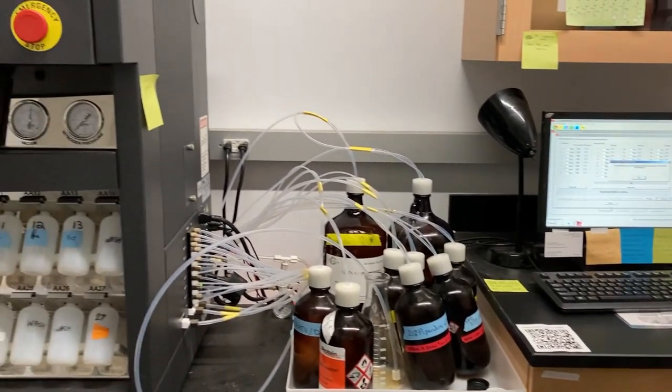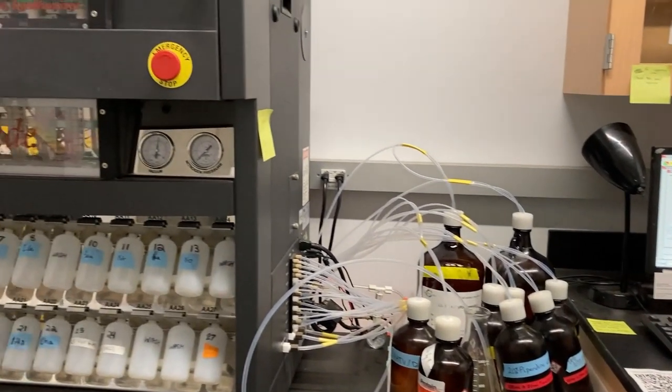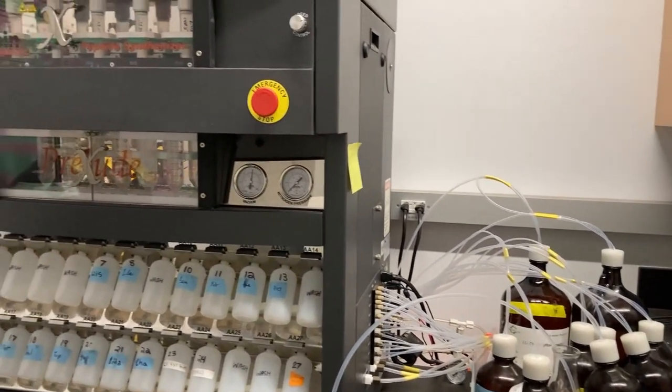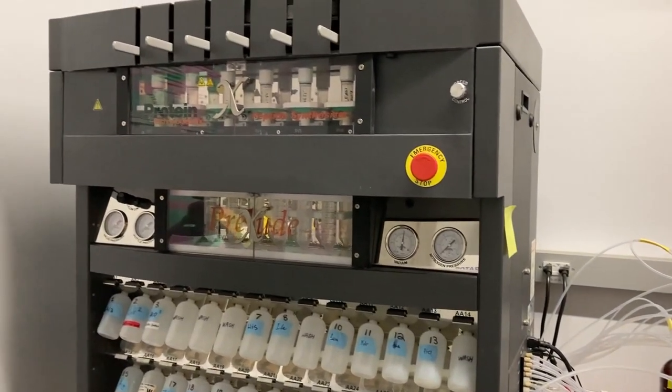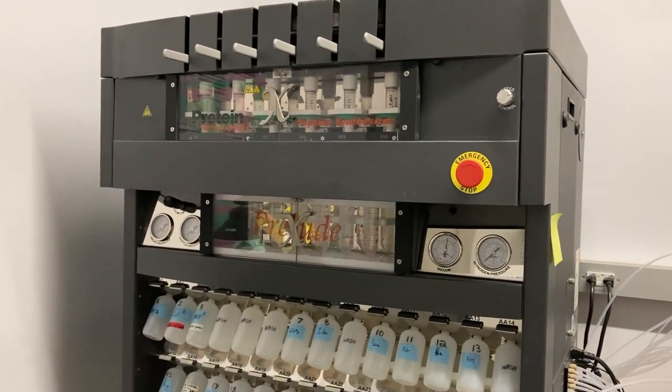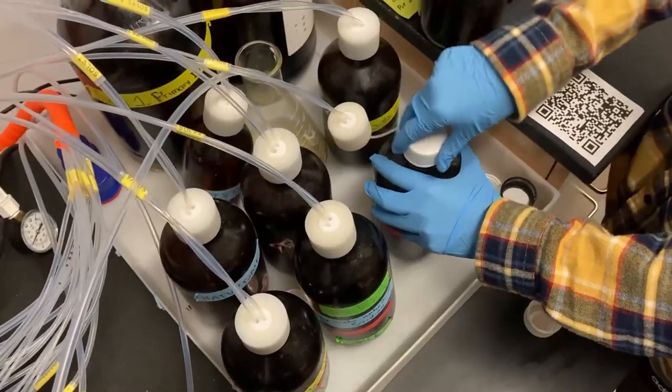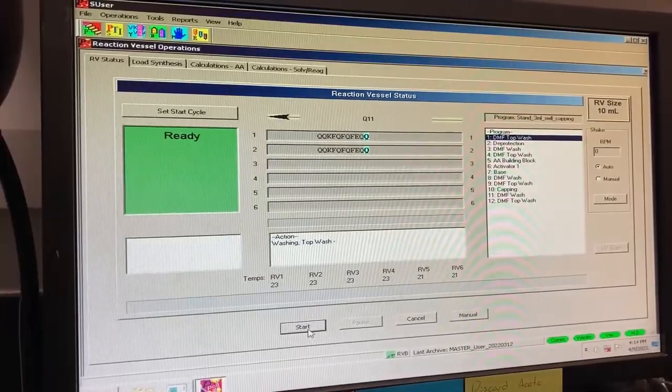To make peptides synthetically in our lab, we use the PreludeX peptide synthesizer. In this video, we will describe how to set up and run a synthesis.